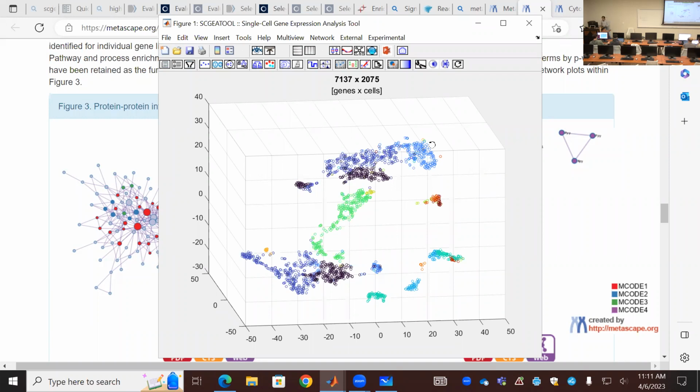For the students, I'm going to give you this as the last homework, which allows you to select a cell type you think is worth trying to analyze for their highly variable genes, understand the function of those genes, and infer what the cell type in that situation is doing.